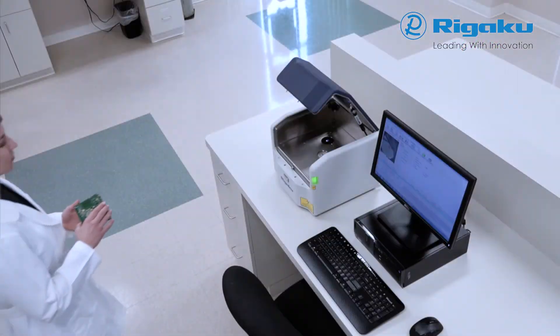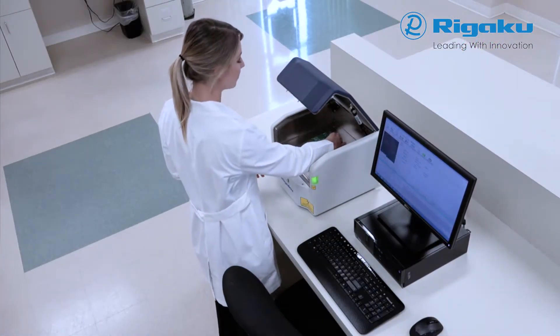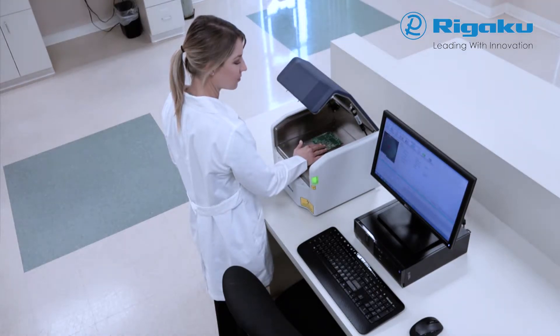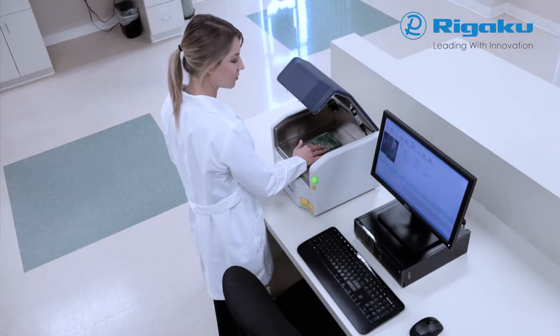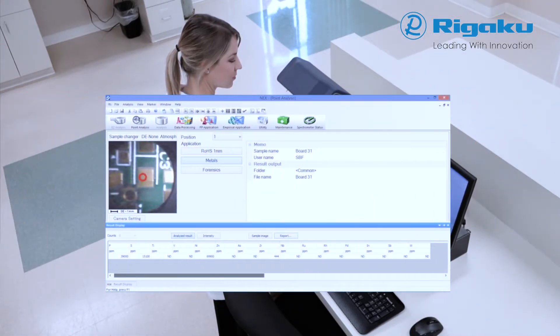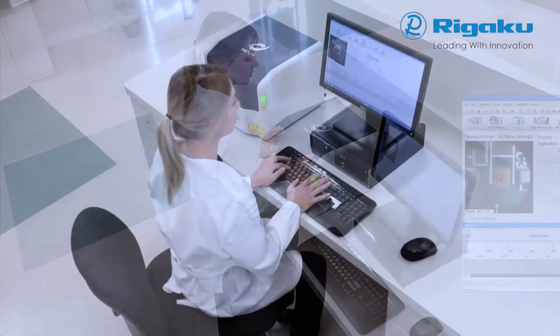For small spot analysis, a sample is aligned by hand, guided by a live camera image with a circular reticle, indicating the exact analysis region.